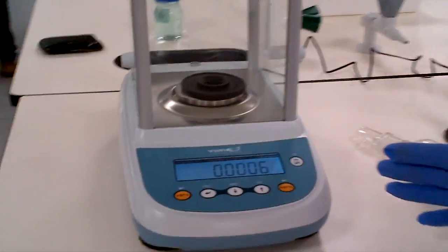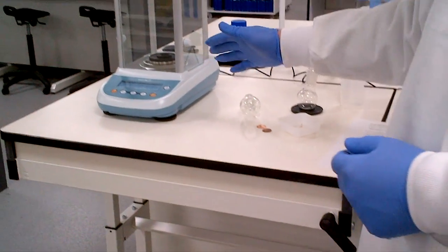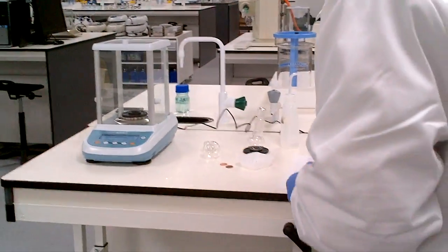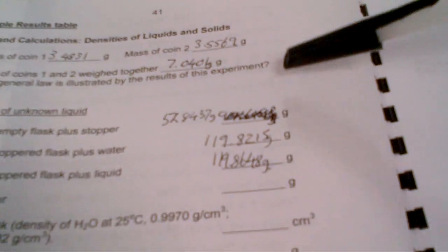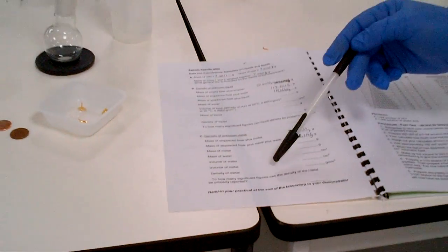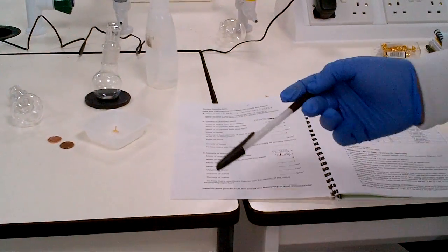if you're using a balance top and you were to lean on it while taking measurements, this would affect the measurement value. So please don't do that. And as well, make sure you are recording the mass of the flask, of the apparatus. The reason behind this practical is to get you to be aware of what the mass of flasks are and to record the mass of flasks before putting anything into it.